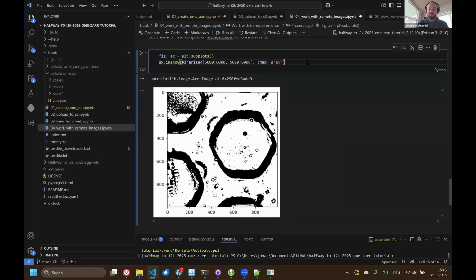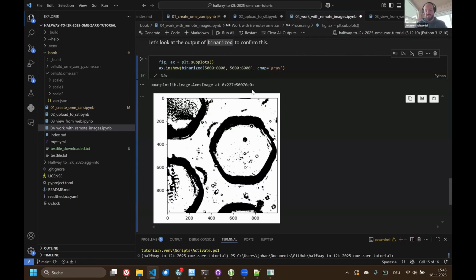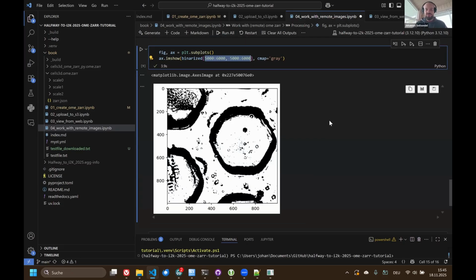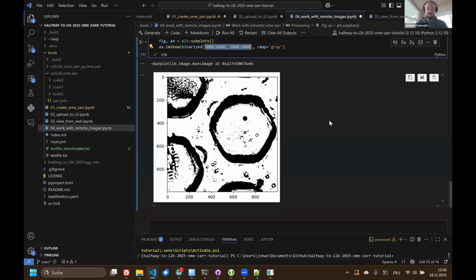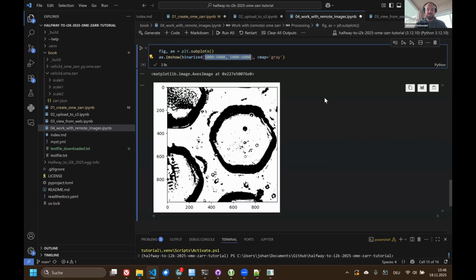But once I do this again, once I plot, only now the operation that I requested, which is thresholding, is actually executed, and only in this range of pixels. So this helps you execute really complex and large-scale workflows on your laptop in reasonable amounts of time, because you don't always have to throw all the pixels into your machine. You can just do stuff on a few pixels and try around without having to stare 5 or 10 minutes at your computer until the next operation is done. And you can then concatenate a bunch of images afterwards.